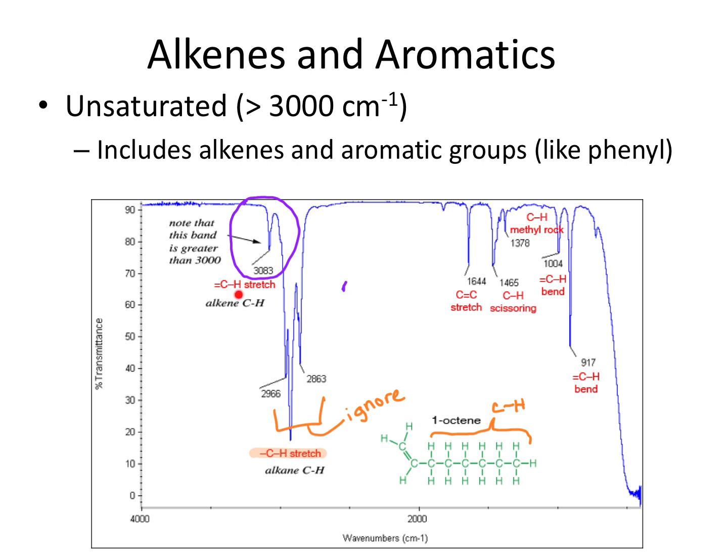So that's the key thing that we were looking for if we're trying to determine what it is. So that's a functional group. Those are the kinds of things you're going to look for. If you're looking for something that's an alkene, meaning a double bond with carbon, or an aromatic, which is a different shape, then that's where you're going to see a key peak that you're going to look for. So above 3,000, it should be very small.